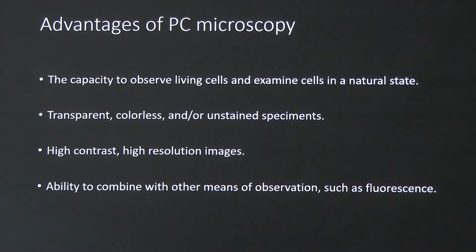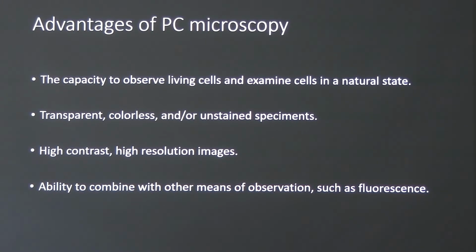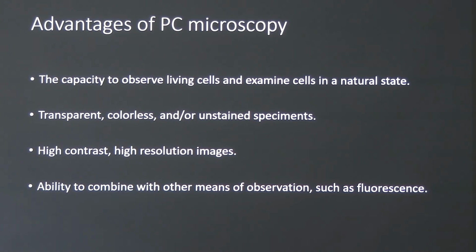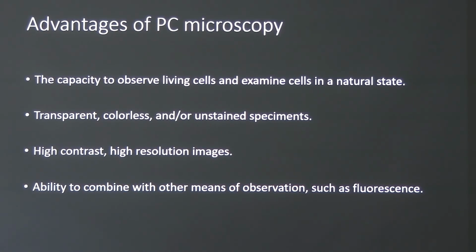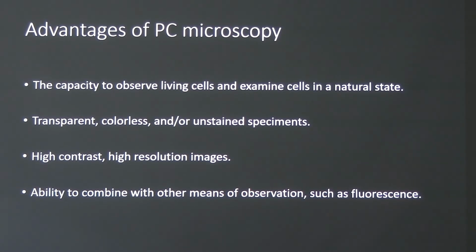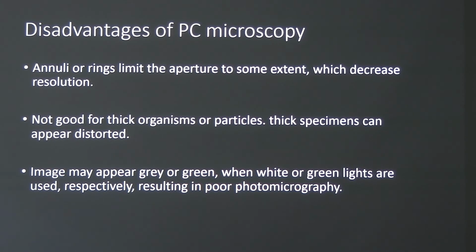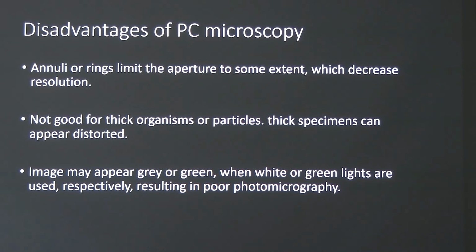Well, of course, for a phase contrast microscope, there are both advantages and disadvantages. I will not read through all of this. When you have time after this and want to know more details, try to read the 2 slides at the end of this lecture. If you have any questions, just ask me or one of the teachers.